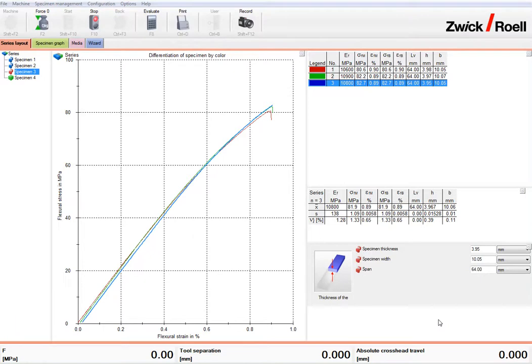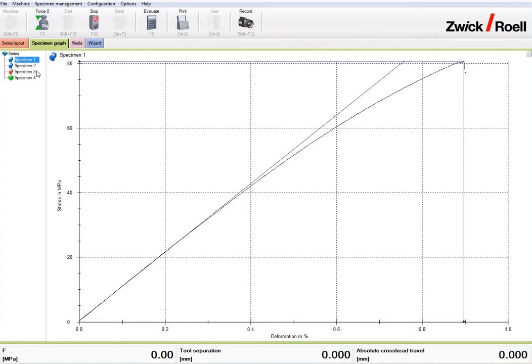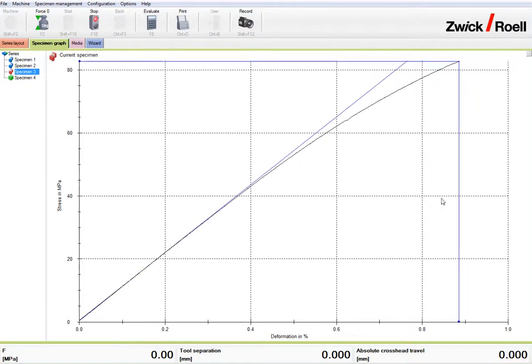As you see on the screen, we have three samples, specimen 1, 2, and 3. And we also have three curves here, which has the data over here in this view that belong to these samples. Of course, you can confirm that by going to the specimen graph, and as you click on each one, you'll see the curve for each sample. So that's the curve that we will be exporting. And of course, you can open that in ASCII format file or in Excel as well.